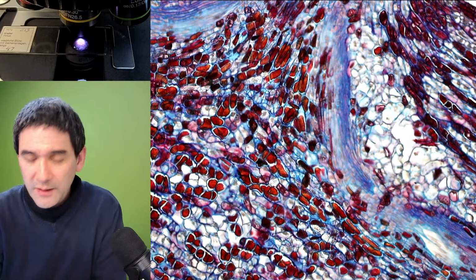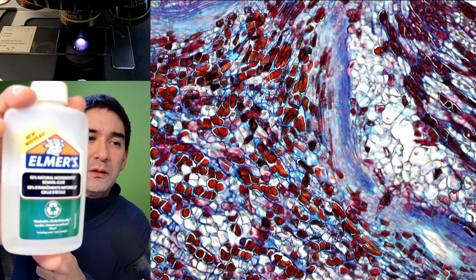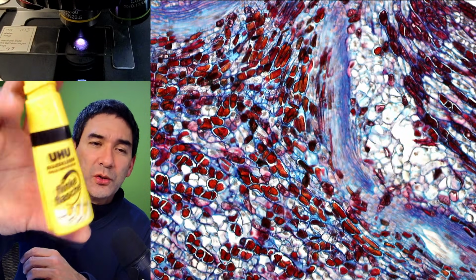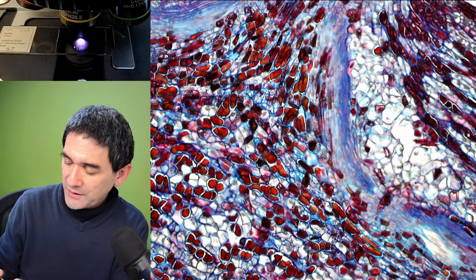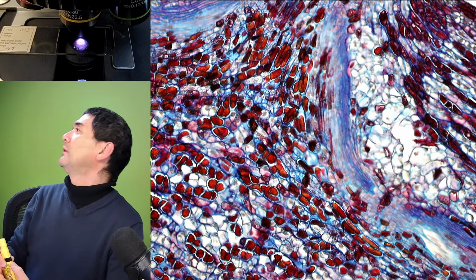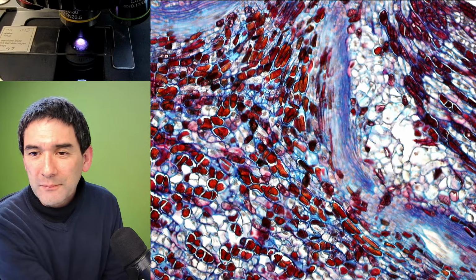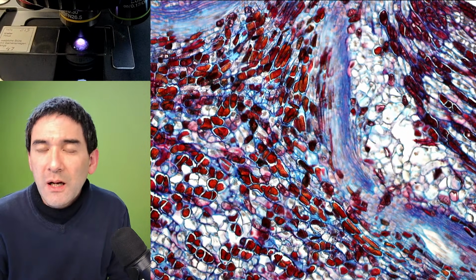Yeah, you can try to use glues. I'm just going to hold it up like this here. It's clear glue. It's Elmer's PVA glue. It's clear water-based glue. And maybe some of you also know this one over here. Yeah, it's not the acetone one, but the water-based one. Yeah. So that is... No, that's the wrong one. That's the regular one. There is one with a green label called solvent free. So yeah, that's basically water based, and you can try. Yeah, refractive index won't be too important. Correct. Yeah. Experiment, I would say.